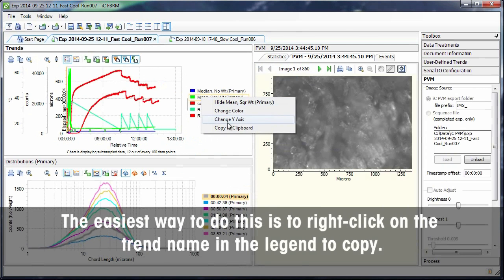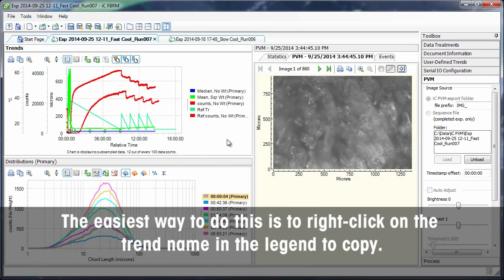The easiest way to do this is to right-click on the Trend name in the legend to copy.